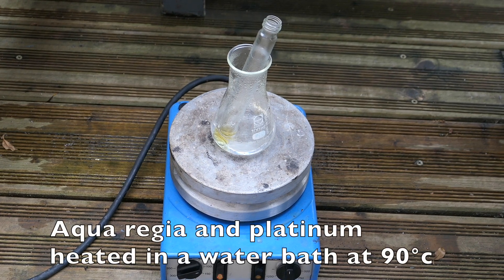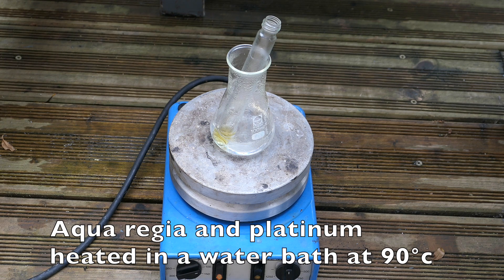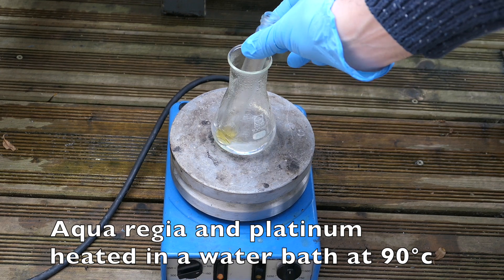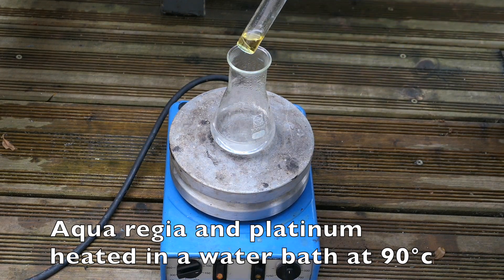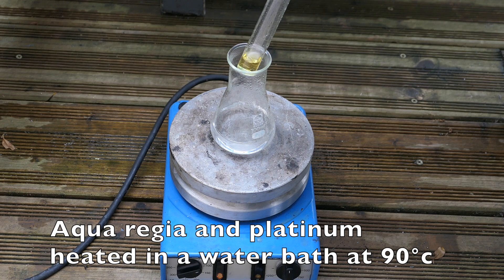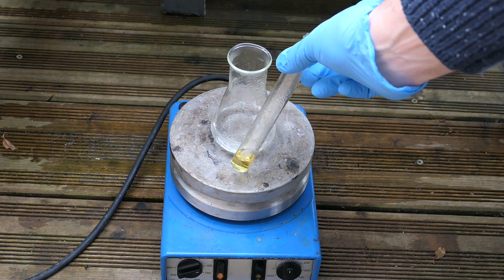Normally to make hexachloroplatinic acid we would use aqua regia, which is a mixture of hydrochloric acid and nitric acid heated to high temperatures. This process is quite dangerous due to the toxic fumes it produces, and it also requires nitric acid which I prefer to avoid due to its hazardous nature.